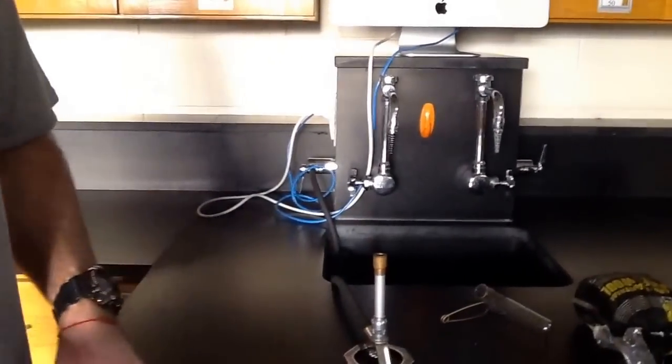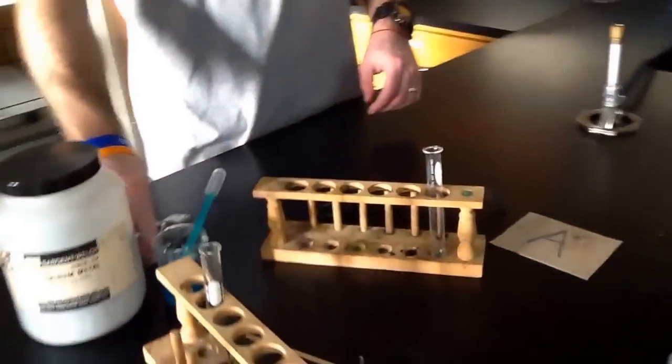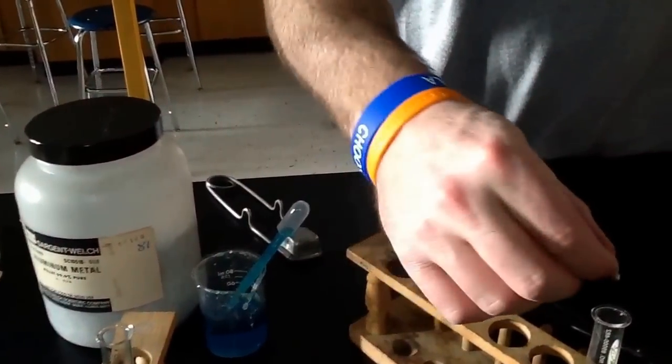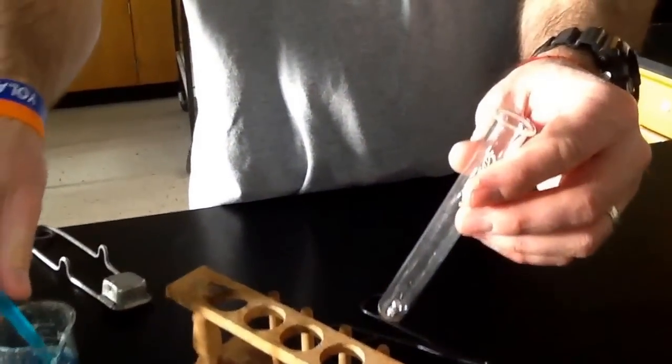Okay. Now we're going to look at a single replacement reaction. So we've got a little piece of aluminum. We're going to drop that into our test tube, and what we're going to do is add some copper chloride solution. Our copper chloride is a nice green-blue color, and so we're going to add that in here.